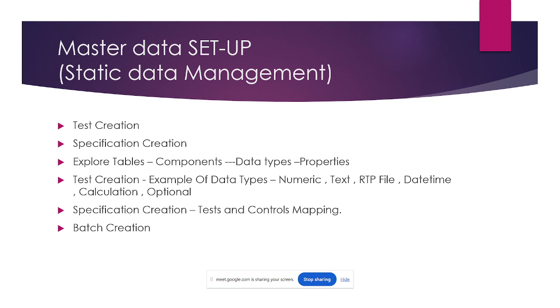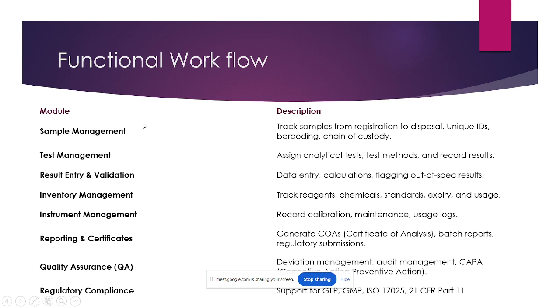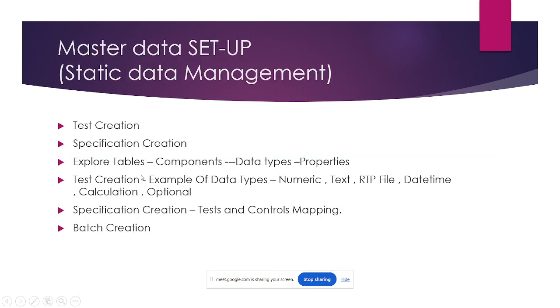Okay, coming to the master data setup, static data management. First, initially we need to create the tests, and after that the specification. Test creation means we create the tests as per the STP. In this LIMS application, there are some tables we configure, like explorer tables, so we can use those tables and create the tests, each individual test as per the STP procedure.